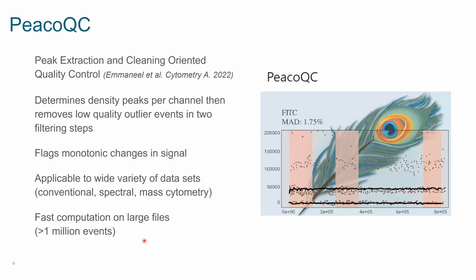You can also make every attempt to make your workspaces more manageable, right? So as we'll learn in the demo for PeacoQ, there's an opportunity to export your clean events to a new workspace. And that would exclude the bad events from the new workspace. And so if you exclude events you don't need, you're going to make those files smaller and more manageable. Okay? So making the workspace smaller, right? Only bringing in the files you're actually going to work with, and separating them by analysis type is probably going to be another good approach to see some increases in computational speed.